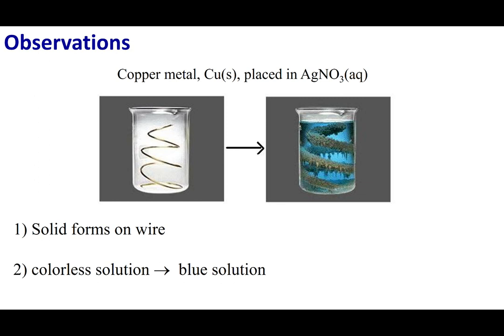What we're going to do is take observations on this experiment that we're going to run. Here's what I'm going to do. I'm going to take a solution of silver nitrate, and in that solution of silver nitrate, I'm going to place this copper metal wire.